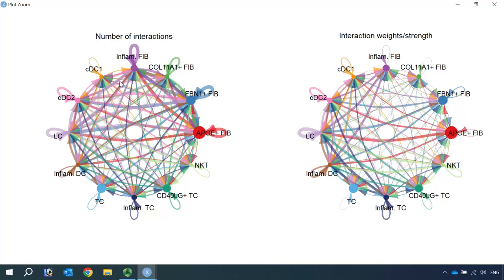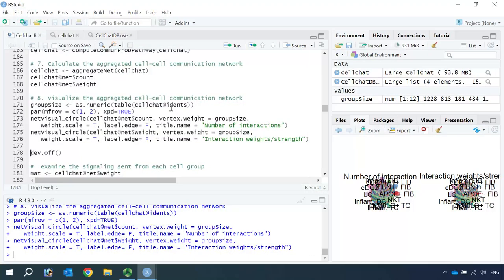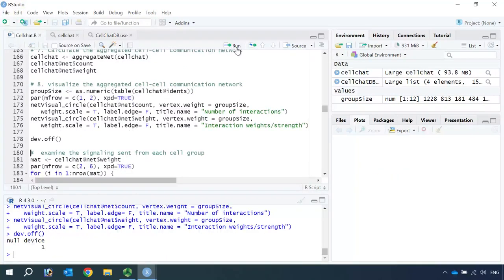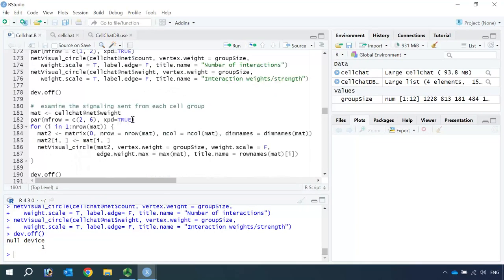We have 12 different cell types in this dataset, so the circle plot is very beautiful but looks quite complicated when we have so many cell types and 47 signaling pathways. If you want to clearly see how each cell type interacts with the 11 other cell types, we can make a new plot. Let's close the circle plot and use the net weight as an example to plot individual cell types and their cell-cell communication networks with other cell types.